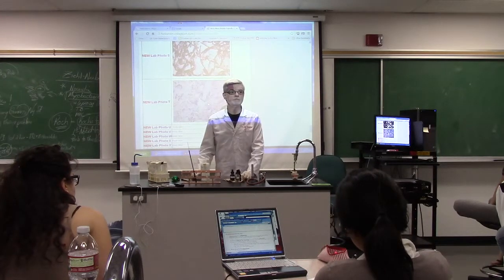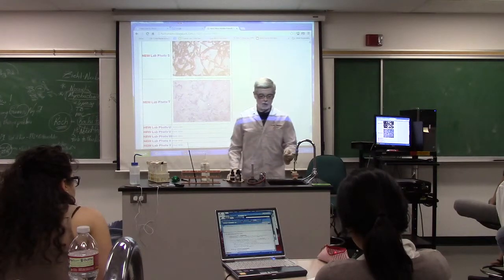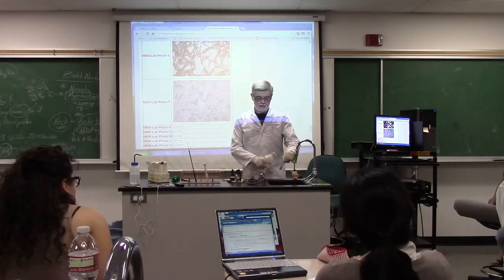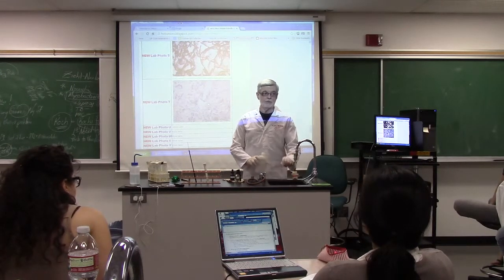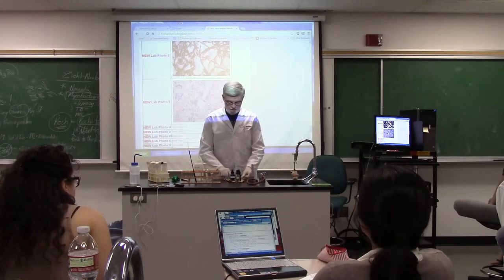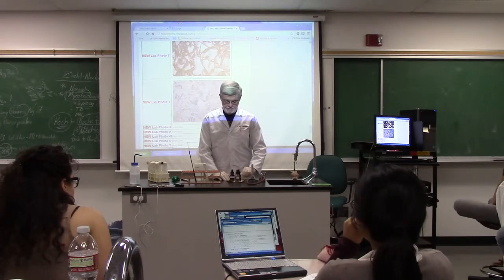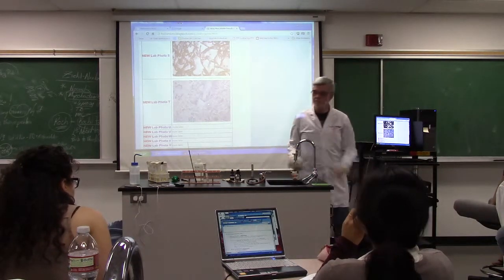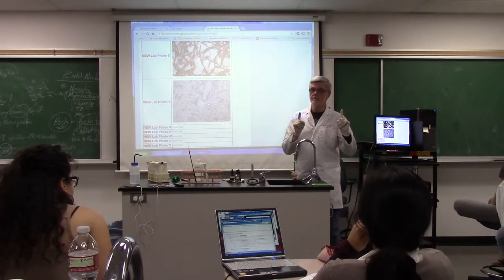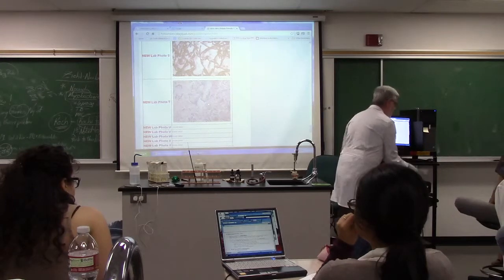Other questions? Okay, I'm going to take my little methylene blue and watch, shake it off. And I'm not going to overwash, I'm just going to rinse around it and let it dribble down. And then I'm going to fold over and blot that dry. And then I'm going to put oil on it and look at it, and I'll have it up here on the microscope. You can get started.